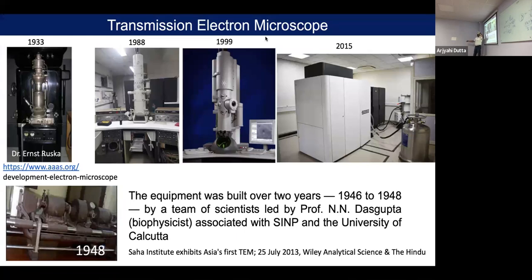And then we have to develop all of this. So even when I started my work, I did that on a regular basis. I was taking all this film, then I developed those things, and then we could see the images.